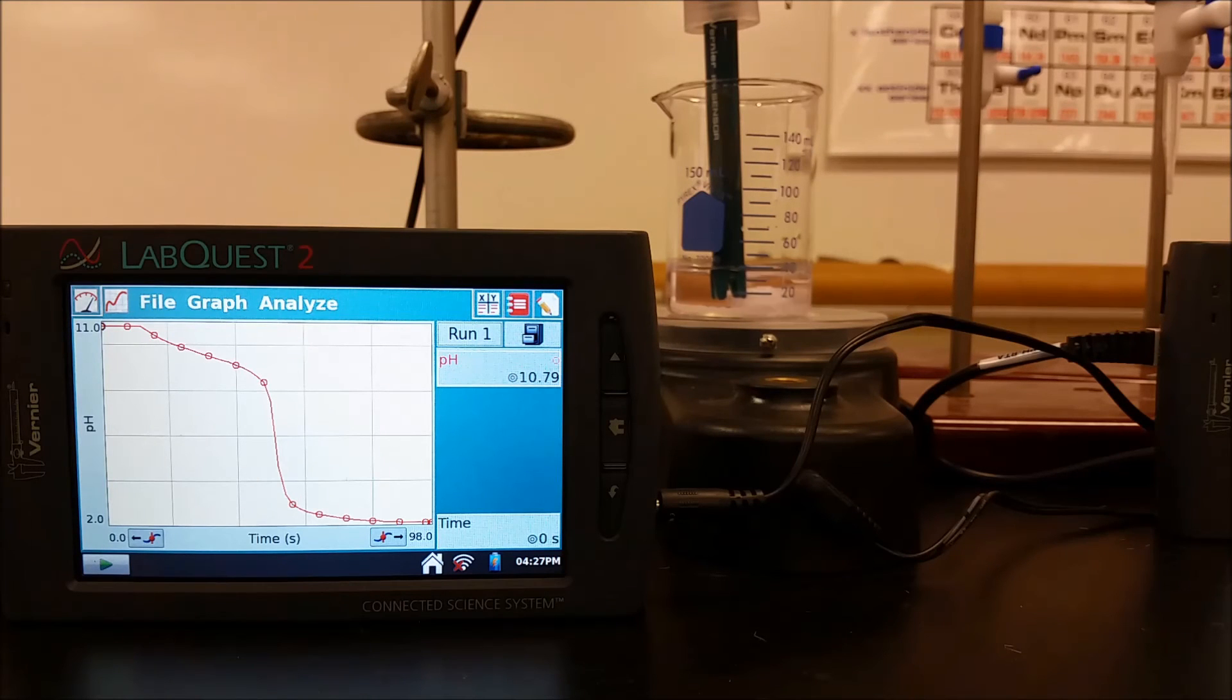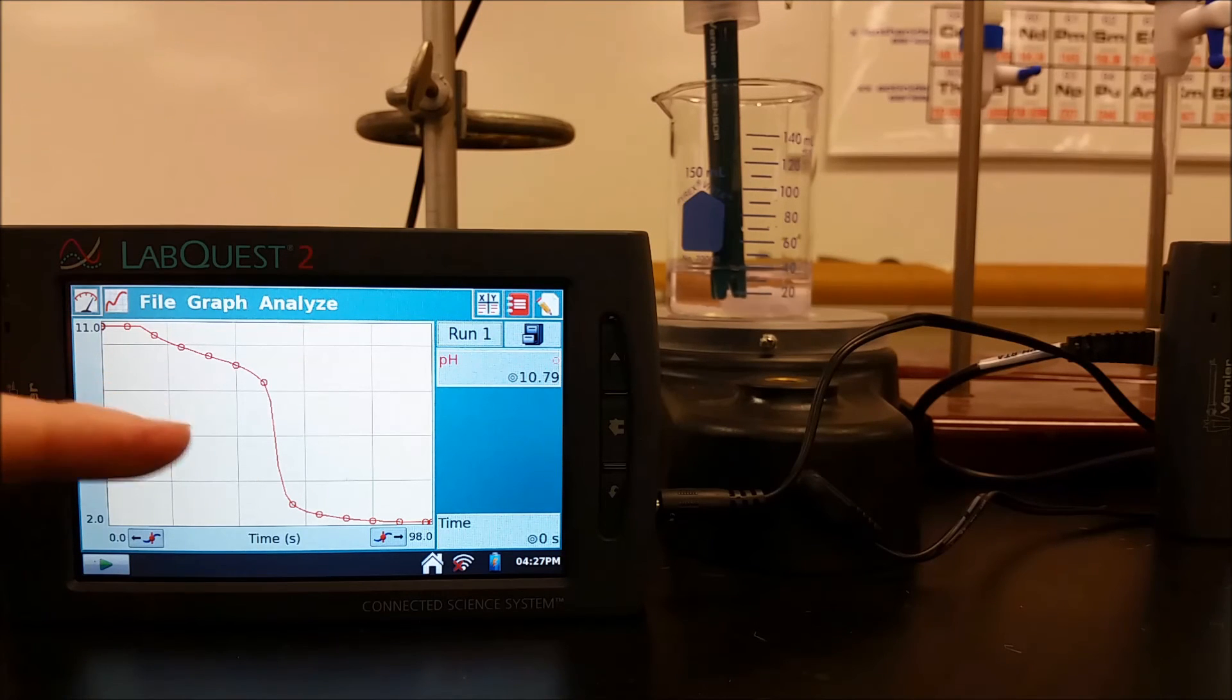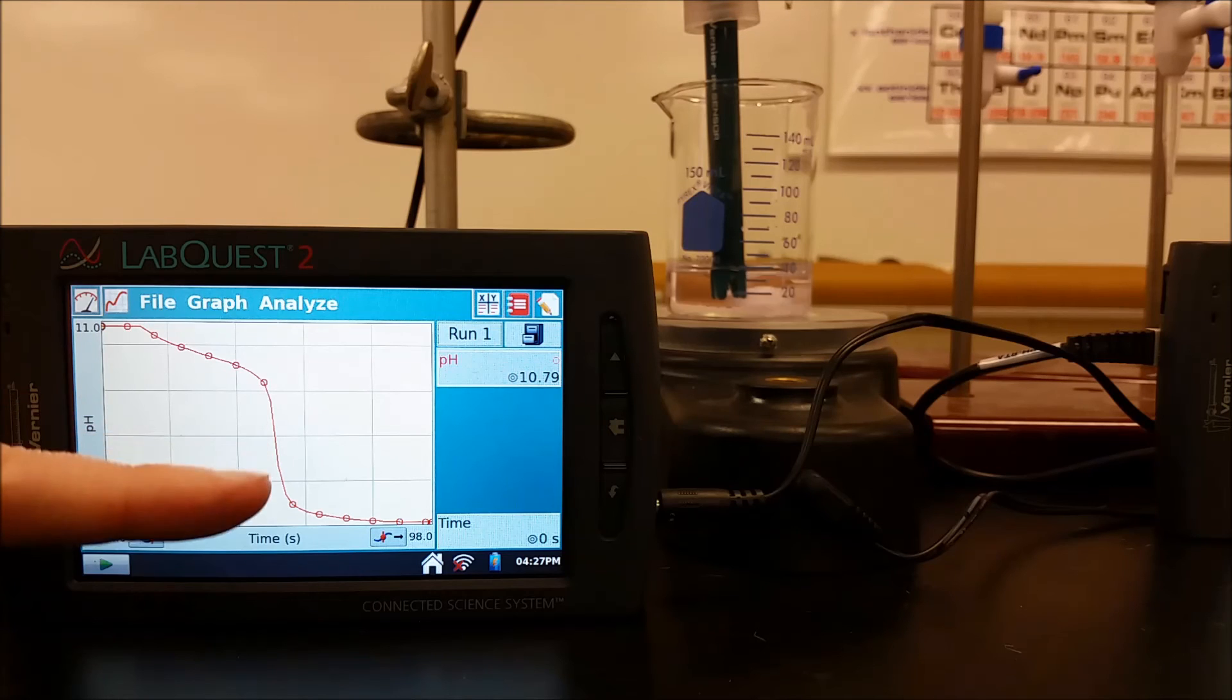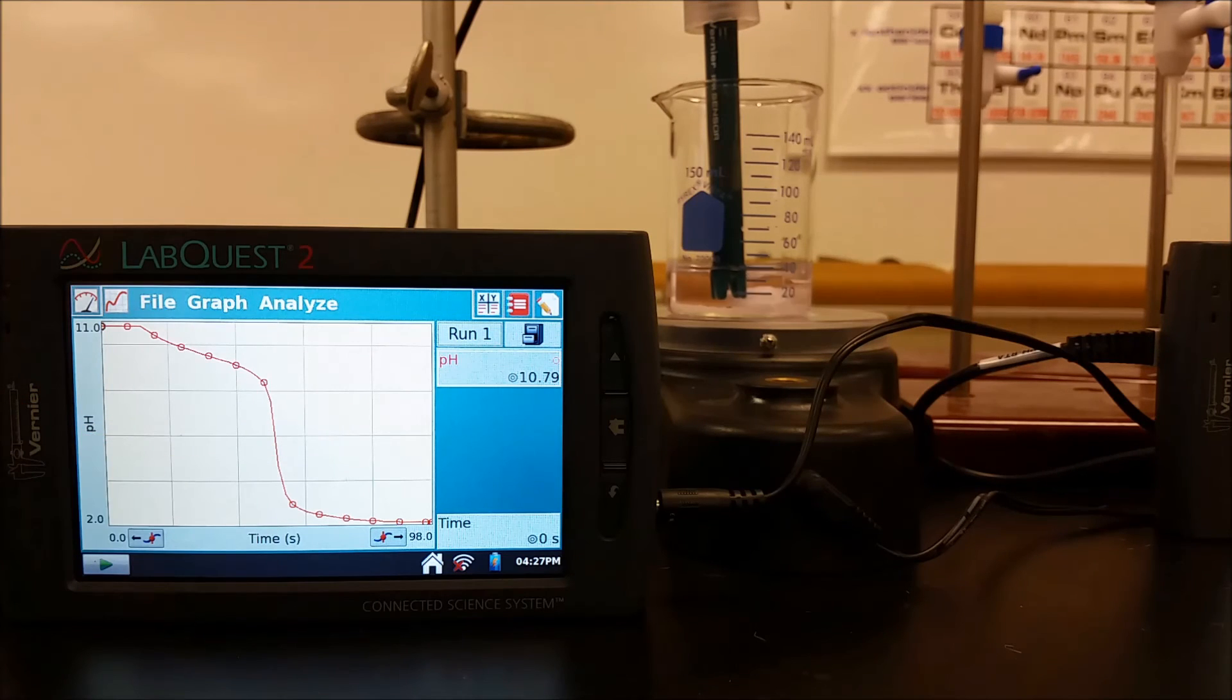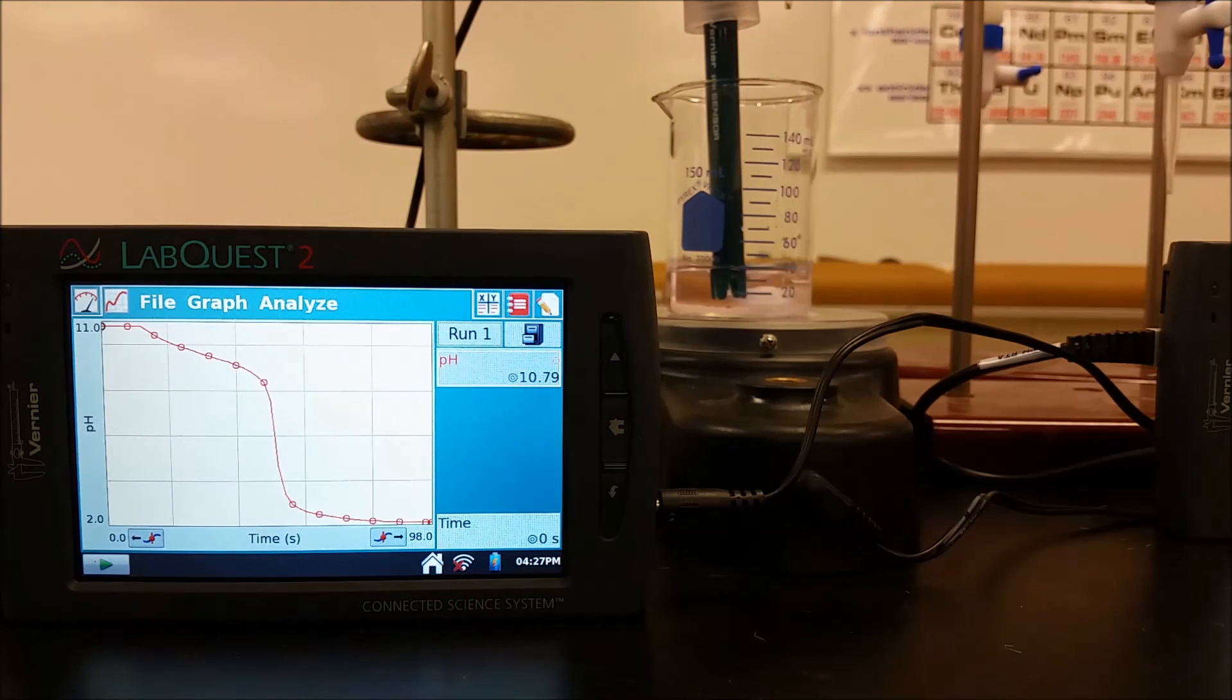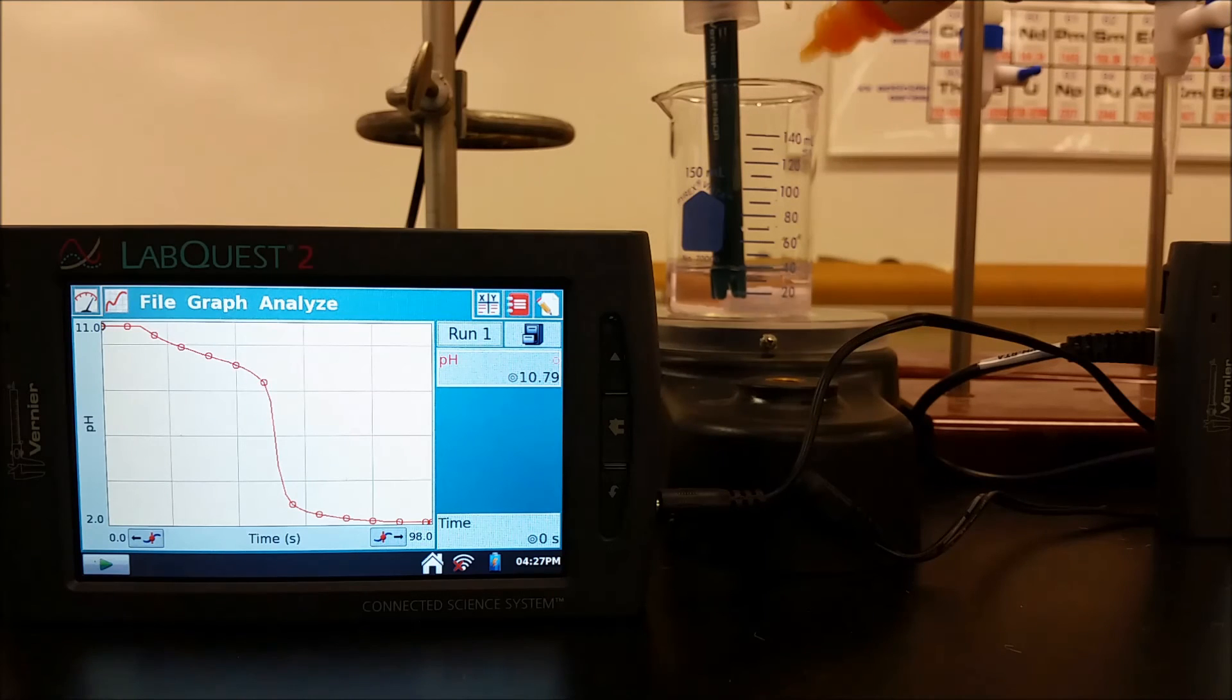We're going to run one more titration, but this time we're going to make sure that we do not end up where our endpoint and equivalence point are far off from each other. We want our endpoint to be at the equivalence point, not well before it. So this time we're going to use a different indicator with the same titration as we ran in the third set. Here we're going to be using the methyl red with our weak base ammonia. So I'm going to add that and that's going to turn yellow.